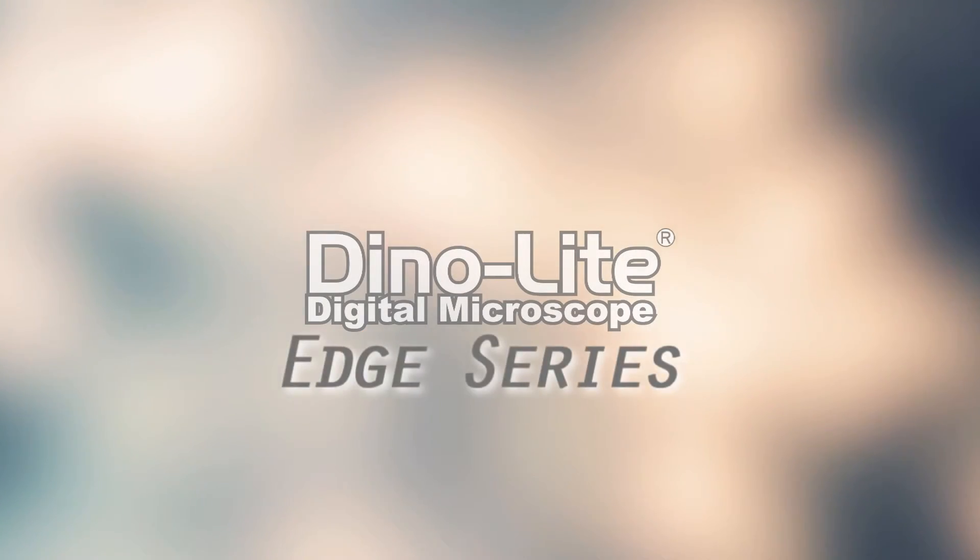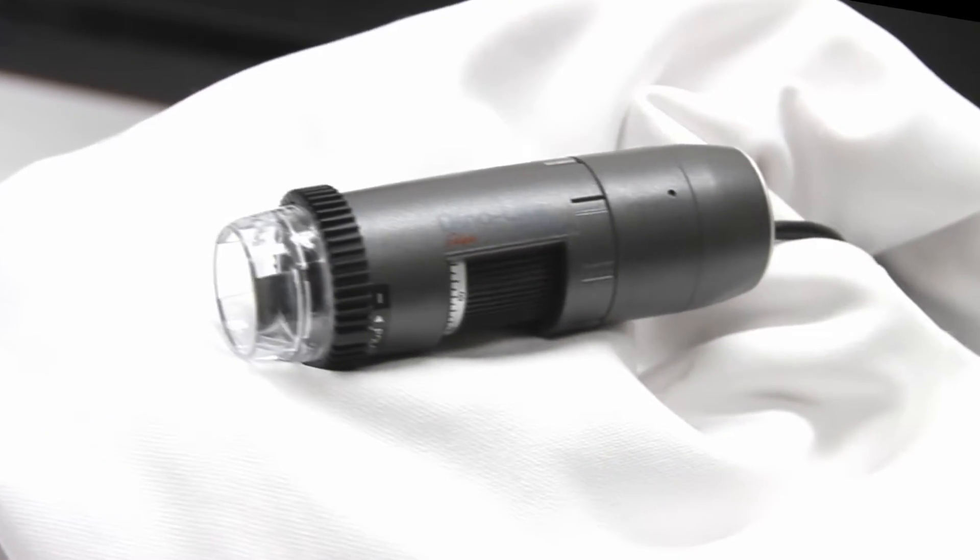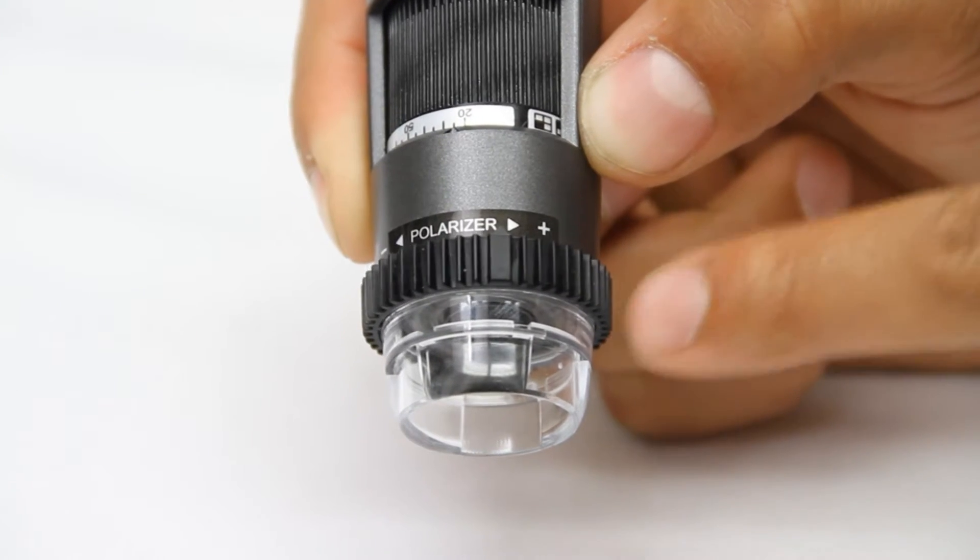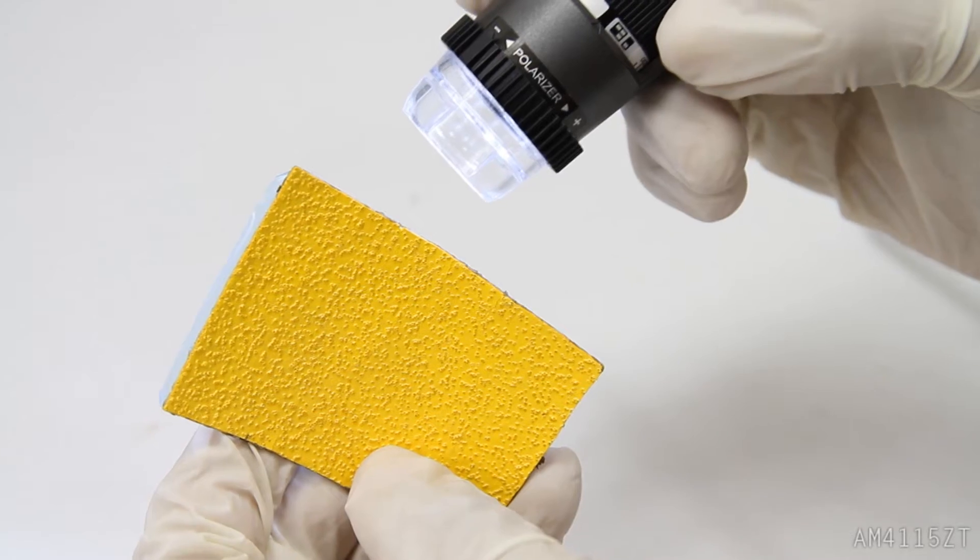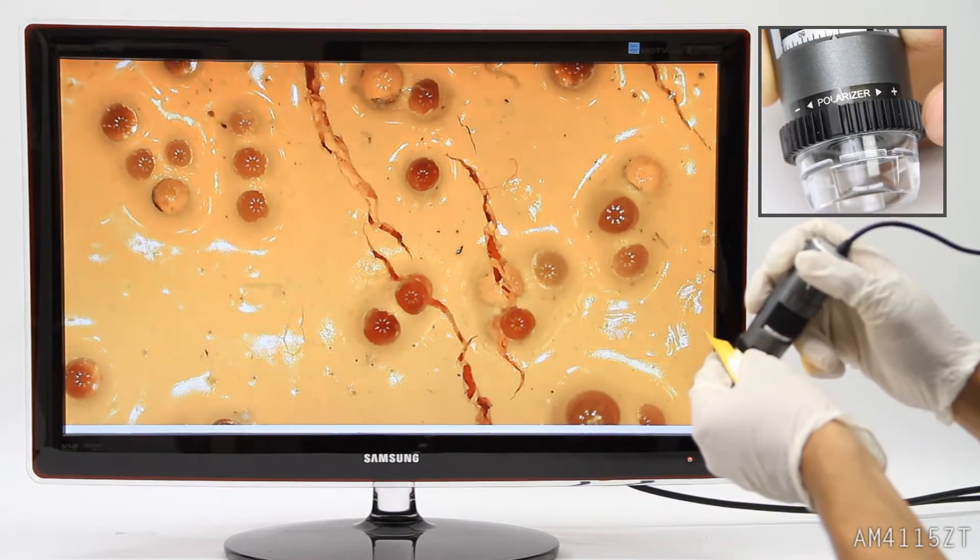Introducing the AM4-115ZT Dynalight Edge handheld digital microscope camera. The AM4-115ZT is the first in the Dynalight Edge series, which features a new image sensor that delivers high image quality with a state-of-the-art lens design.